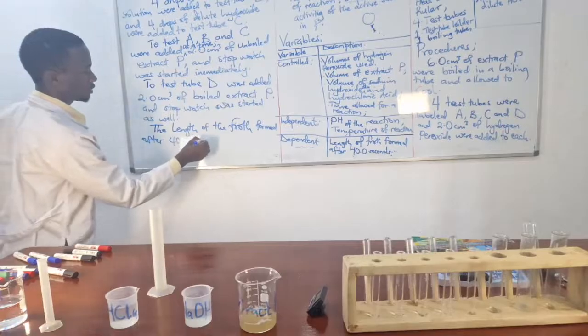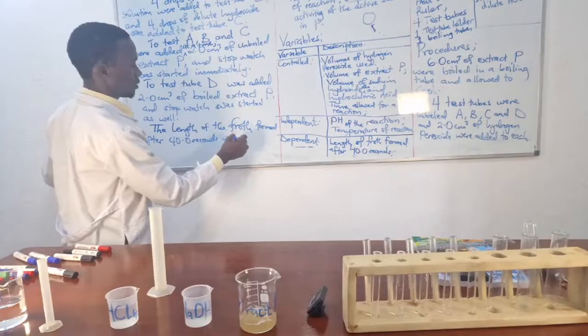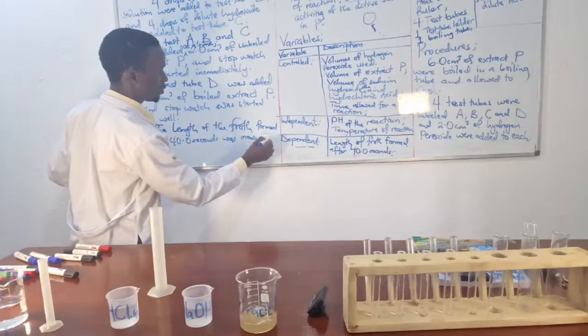The length of the froth formed after 40.0 seconds was measured. What did we use?